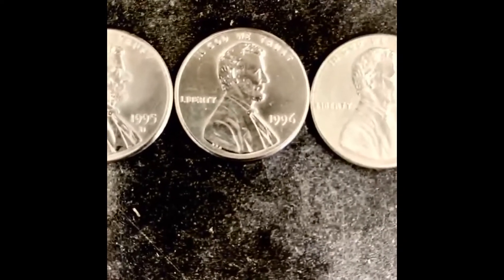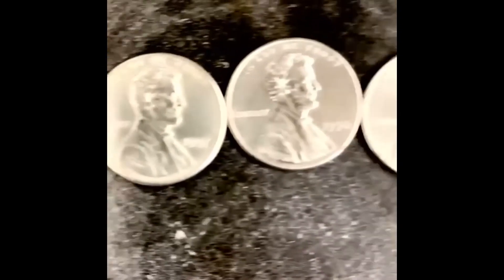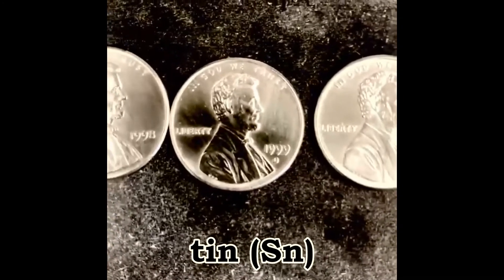In this video, I'll show you how you can coat pennies with a beautiful silver-colored plate that'll last for years. The coating is made of tin, which is a silver-colored metal.